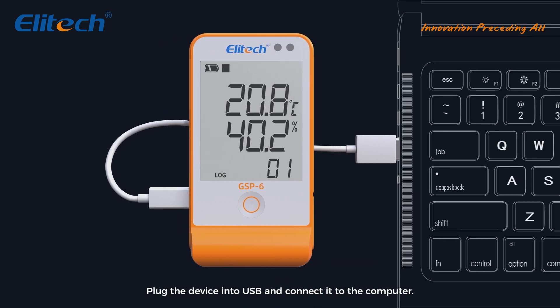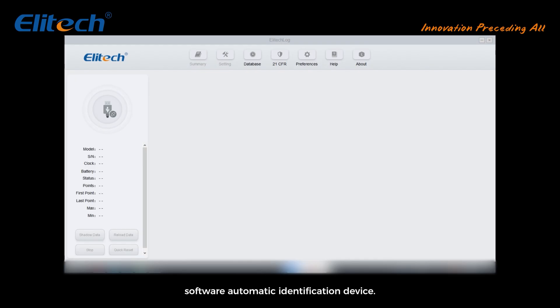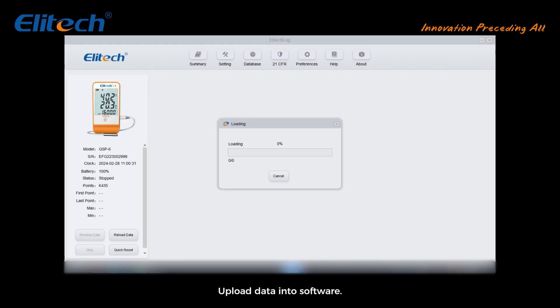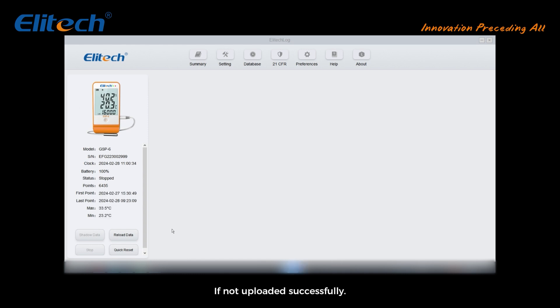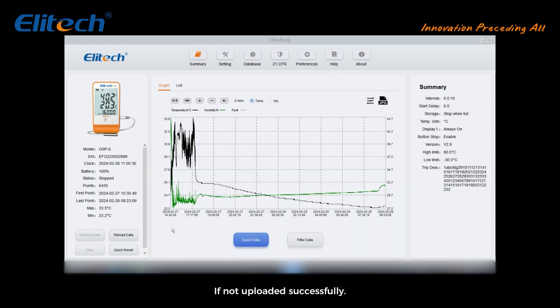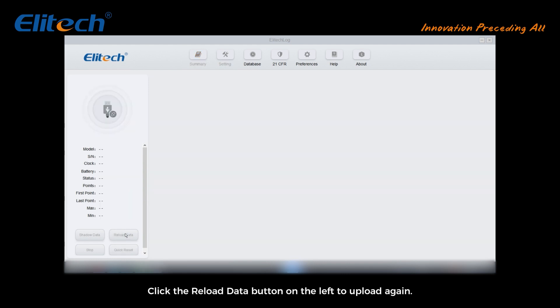Plug the device into USB and connect it to the computer. The software will automatically identify the device and upload data. Do not do anything during the upload — wait for it to complete. If the upload is not successful, click the Reload Data button on the left to upload again.